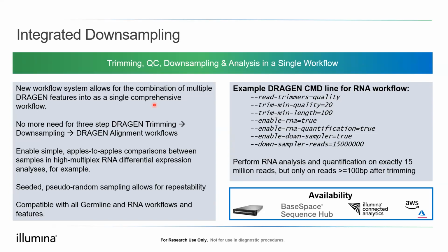As users get different samples, they may want to align those samples at similar coverages, where downsampling can happen, or if you're running some titration testing, where you want to figure out exactly what coverage you might need to get the best accuracy or the best F1 score, where you are not oversampling the samples, or whether you're undersampling. So this can help you do some of that testing.